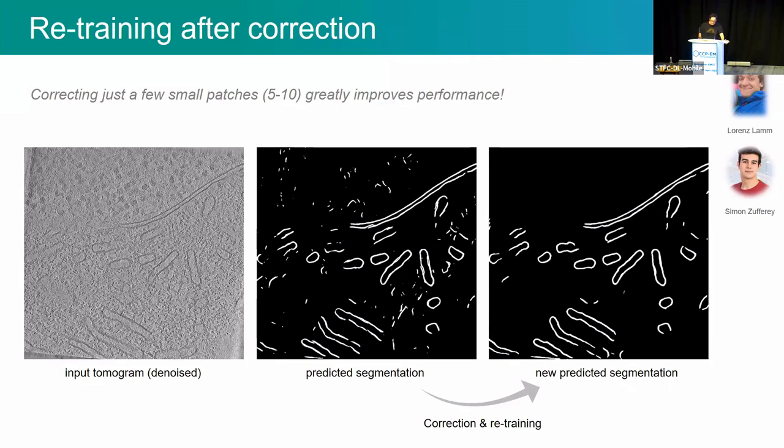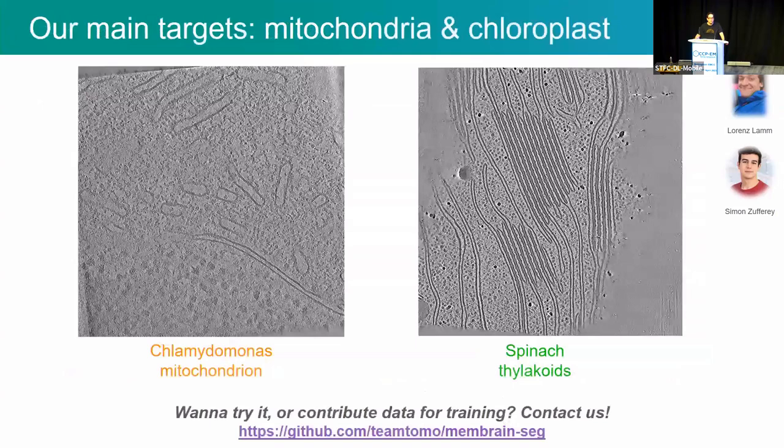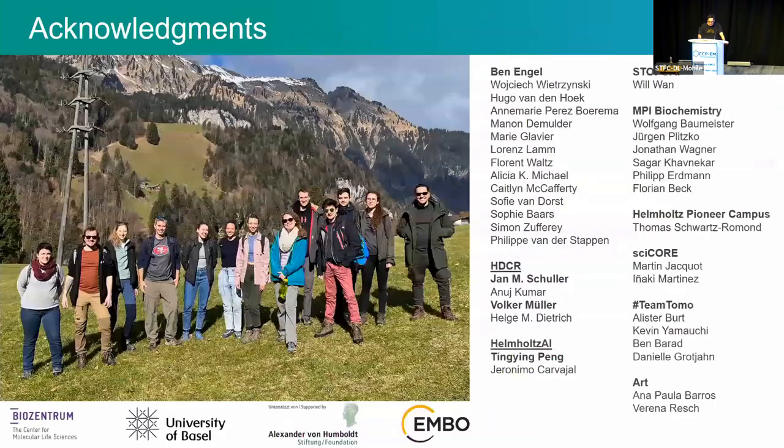And why are we creating these tools? Going back to the start of my talk, we are interested in understanding carbon fixation and other processes in the cell. Nowadays with automation, we will have much larger data sets that we want to study in a more or less automated fashion. Like Tristan mentioned in his talk, with the scale of these data sets, it's becoming almost humanly impossible to manually look at the data. So we need tools to help us. Here are 2 examples of mitochondrial segmentation and thylakoid membrane segmentation.